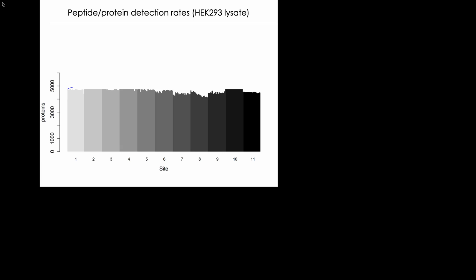We also learned, and this is now just a mock-up, that when we keep adding data, we are fairly confident from the underlying statistical model, as I'm sure was discussed in the course, that there are issues of false positives and control of FDR, and so we feel fairly confident that we could control the FDR in a particular sample. But what happened when we added 100 or 200 or more samples as an aggregate? Because we have a large number of samples, we observed that the more samples we added, the more proteins seemingly got identified. So this is a surefire indication that there is an accumulation of false positives.